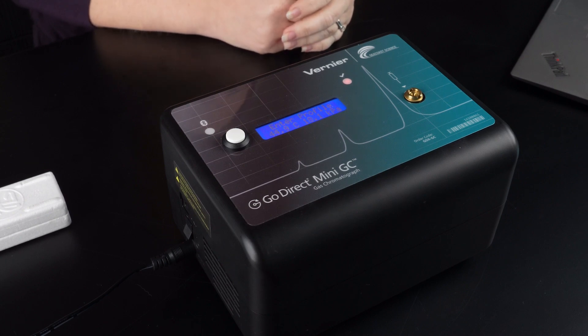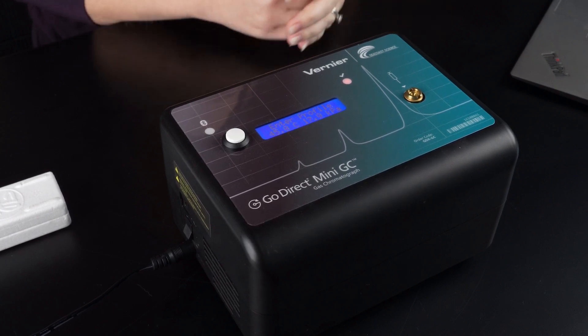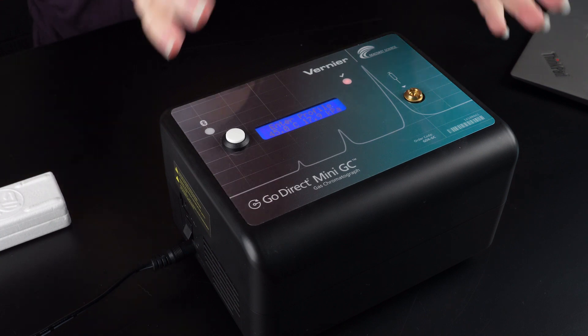I want to address a few commonly asked questions about our Mini-GC. There is little to no maintenance that needs to be done — you don't need to prep the column or bake the column, except for troubleshooting purposes. There are no user-serviceable parts on the Mini-GC, which keeps the cost of the instrument low, but also predetermines the list of compounds that can be detected. For this reason, I highly recommend going to the book of free experiments included with purchase, reviewing those experiments first, and reviewing the complete list of detectable compounds available on our website.